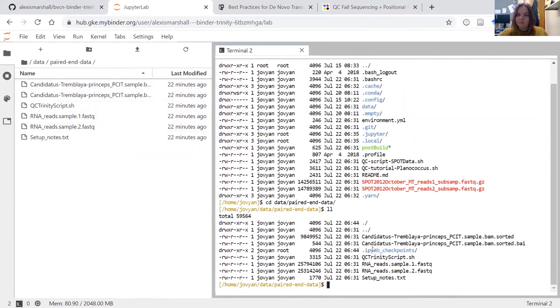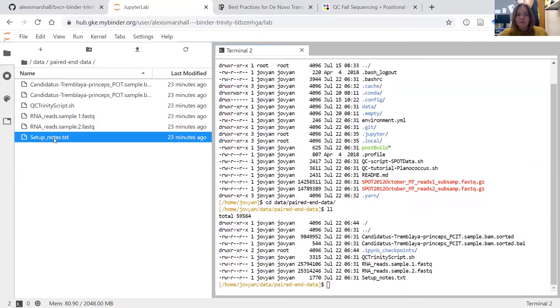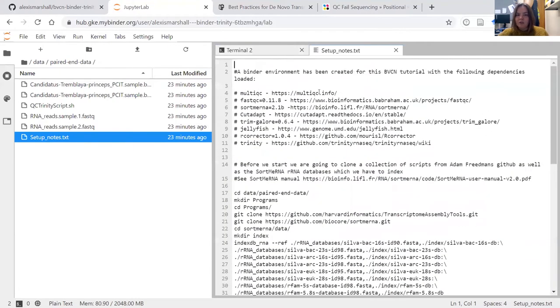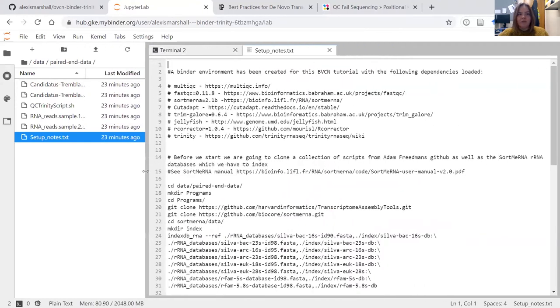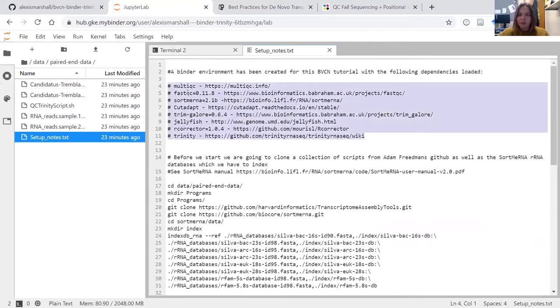What we're going to do first is some housekeeping to make the lesson work properly. If we double click on the setup notes file, it will open a notepad environment that goes through the things we need to do to get the tutorial working. I've listed the programs that are preloaded in this Binder environment with links to their websites. I highly recommend reading the manuals for each program. MultiQC, FastQC, SortMeRNA, CutAdapt, the rapid TrimGalore, Jellyfish, RCorrector, and Trinity are all loaded.